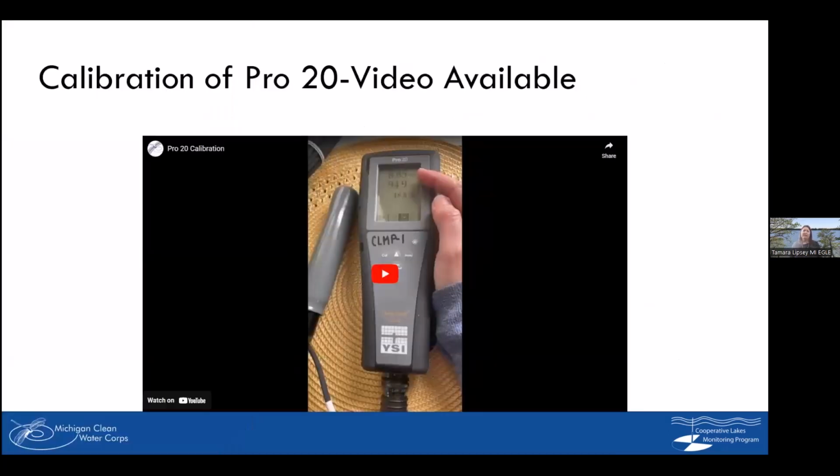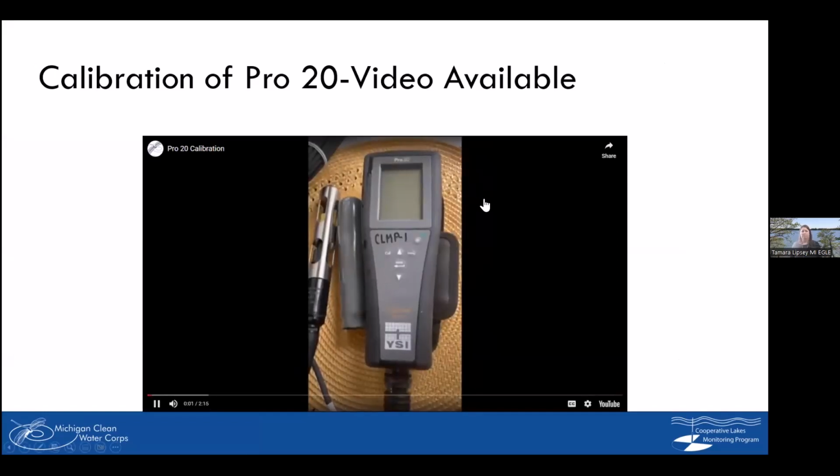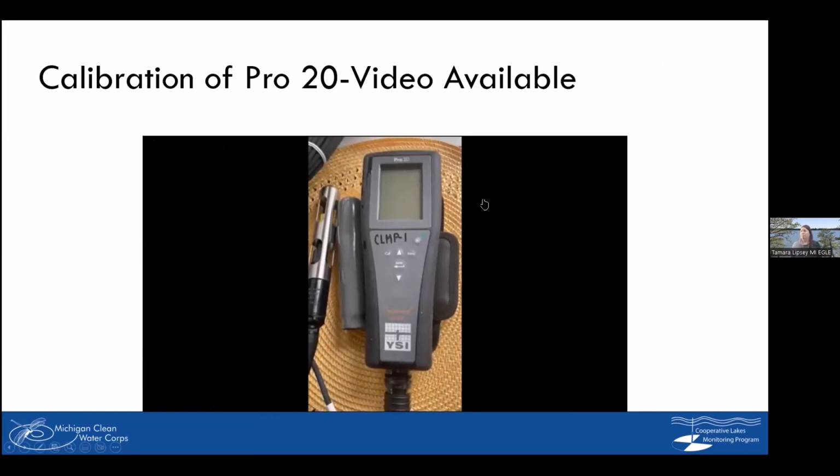So here is a video that's available online of how to calibrate a Pro 20. This video is to show you how to calibrate your YSI Pro 20 dissolved oxygen and temperature meter. It's really pretty simple.